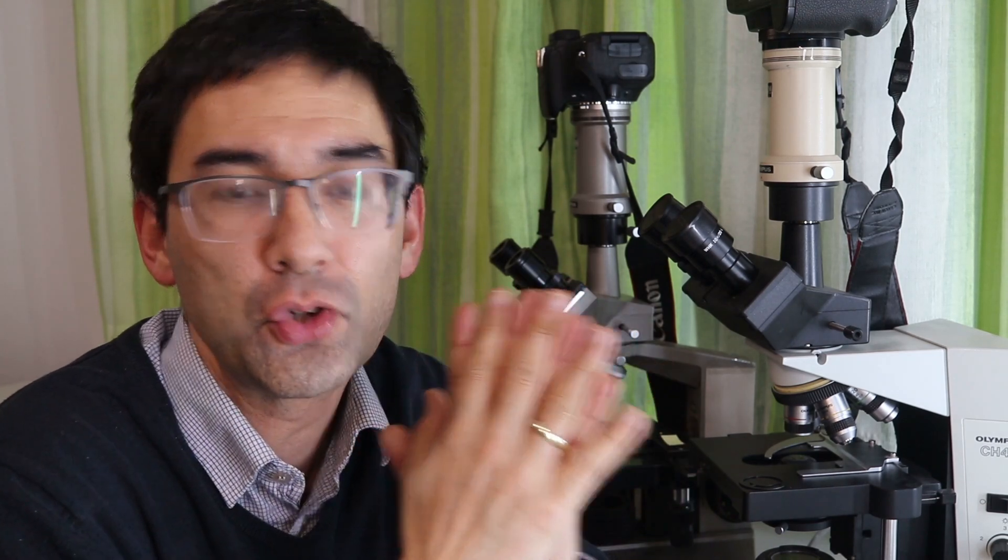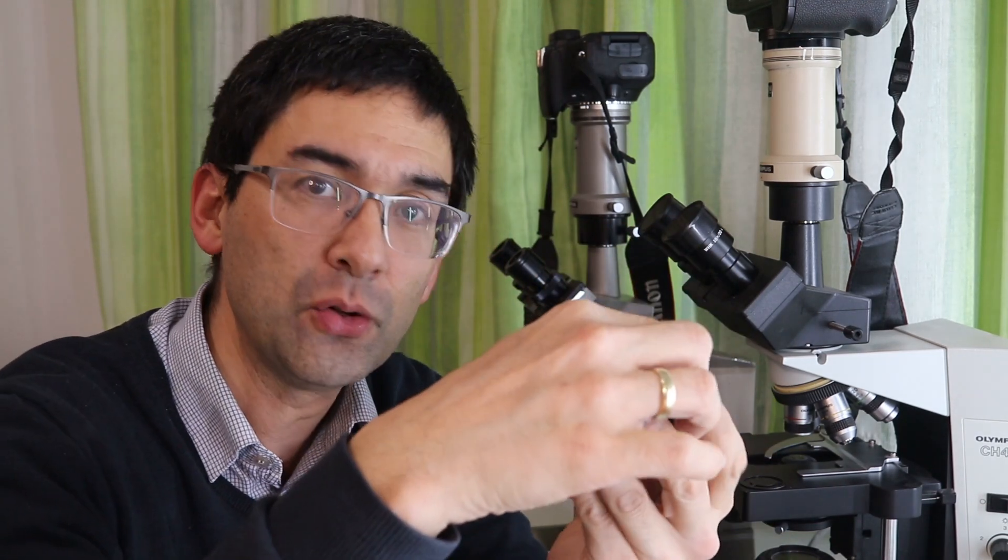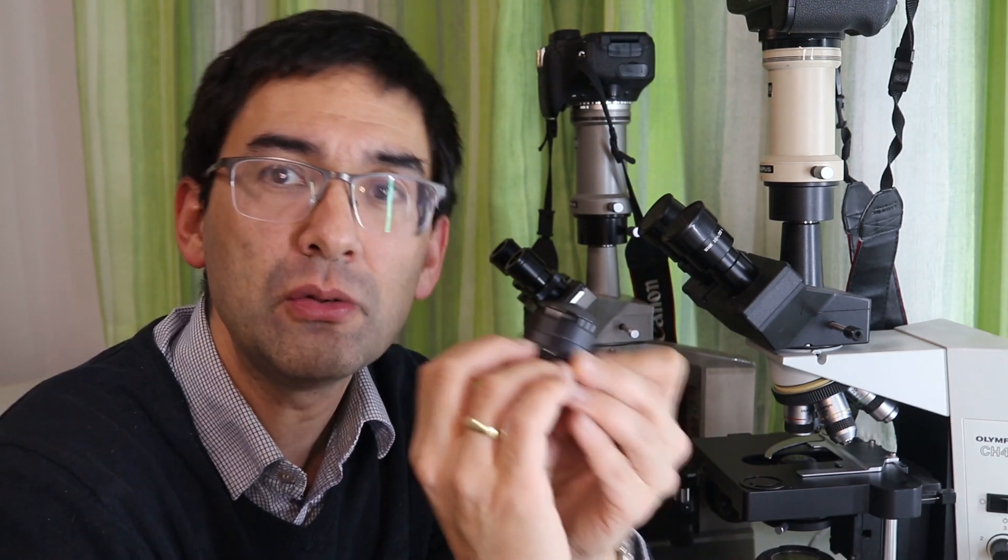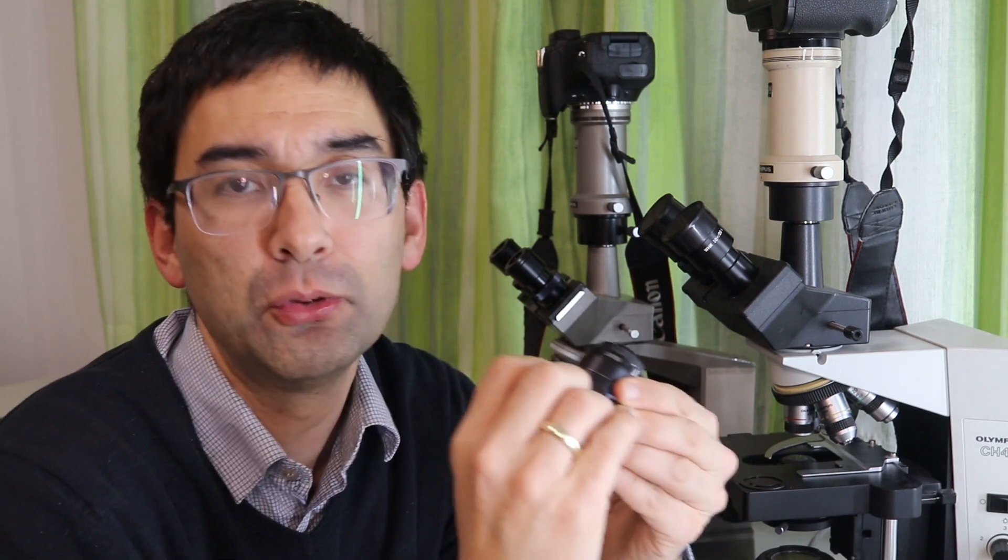Basically if you buy yourself a microscope, get one, get yourself one that has a condenser on the bottom and also one that has a mechanical stage because you need to have a condenser like this to be able to do dark field.